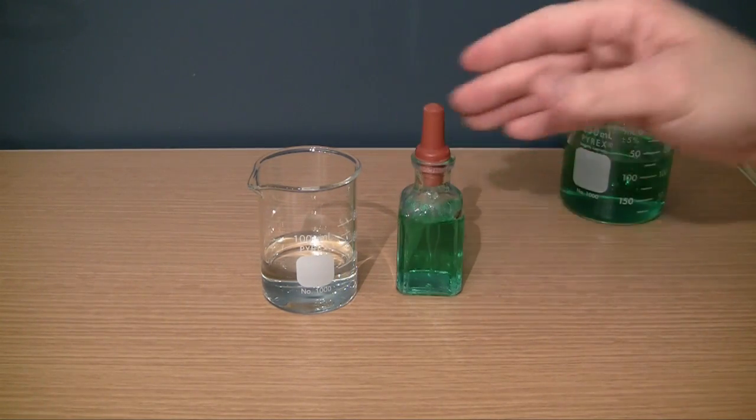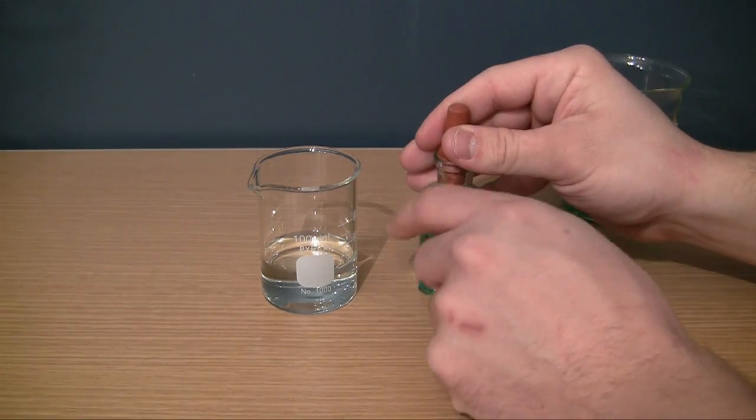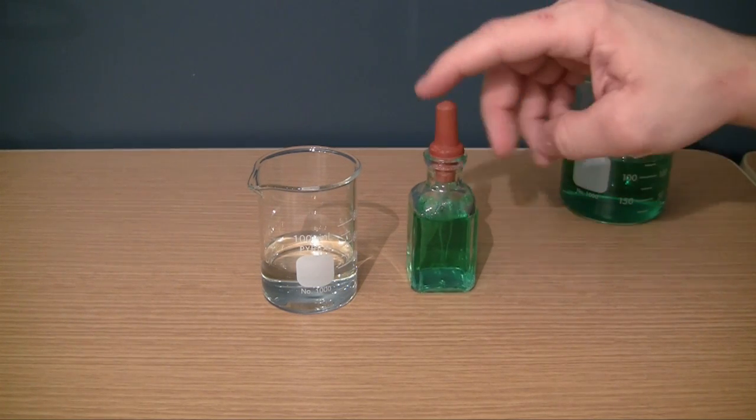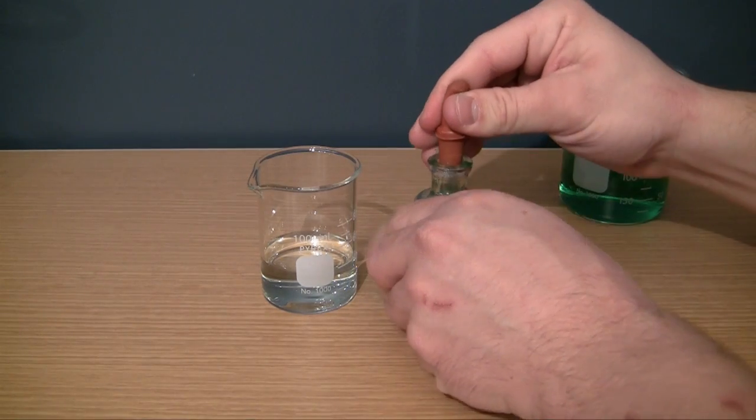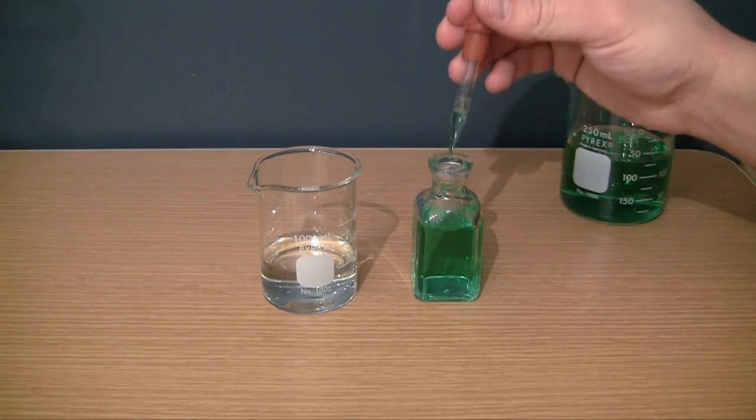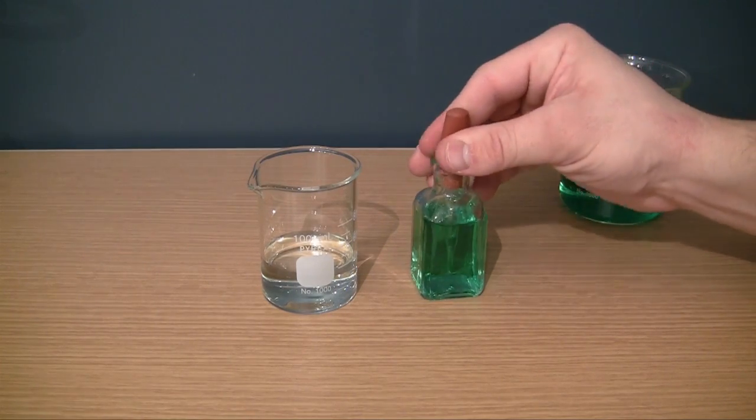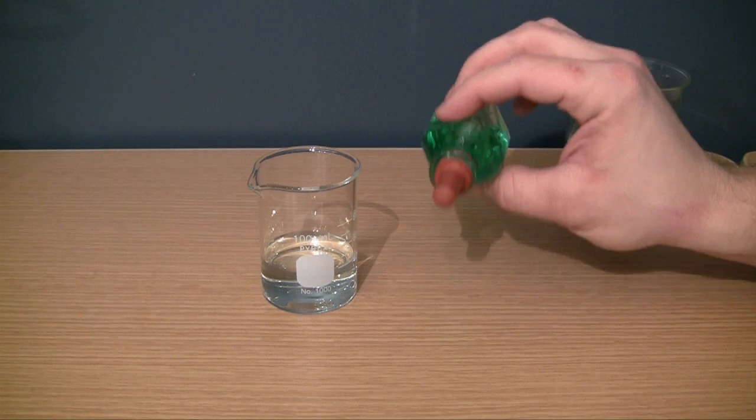Now as you can see it's made up of a couple different components. It's usually a big thick glass bottle and also a glass pipette. And also this rubber bulb is not only a dropper so you can suck up the liquid and drop it in little by little but it's also a plug for the container. So pretty freaking cool. Dual purposes there.